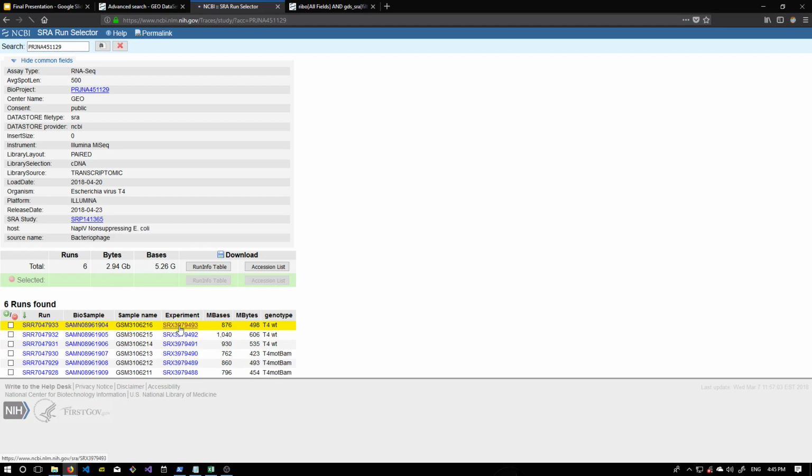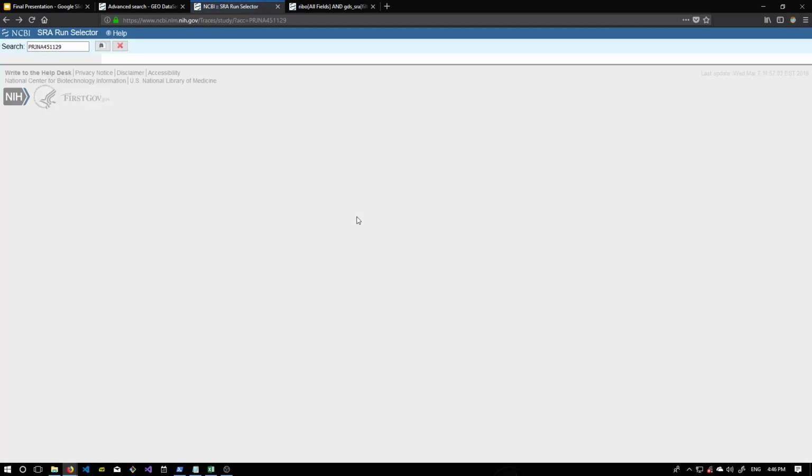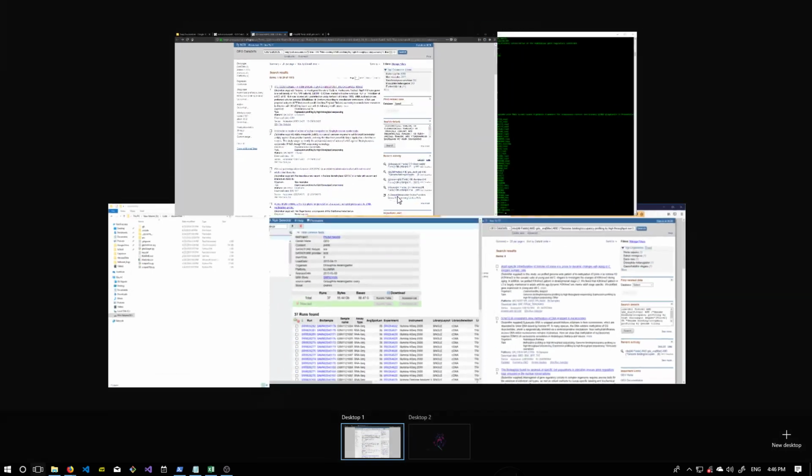So we scrape this and we go to it, just like in the slower route. And then we take the same data as the slower route, we take the SRR code, and we take the size. But we also take this sample right here, which is the sample title. And this is because the experiment page is consistently structured like this. We can trust that this is how it's going to be set up, so we can scrape the data reliably. Now you notice that that's only one GET request less, but it's one less GET request for every sample, which adds up really fast, especially for articles that have thousands of samples. That adds up a lot. So I think that's enough of explaining what we're scraping and why.